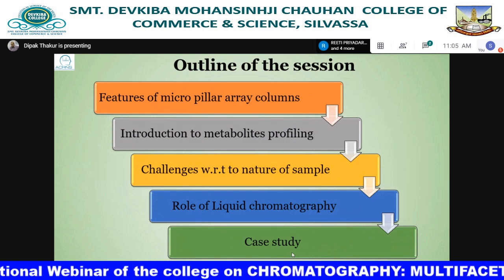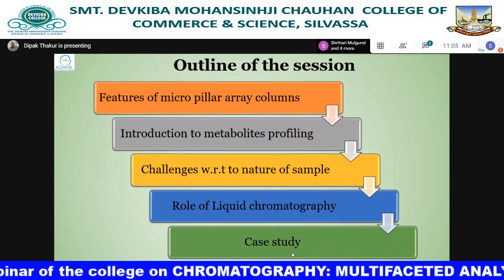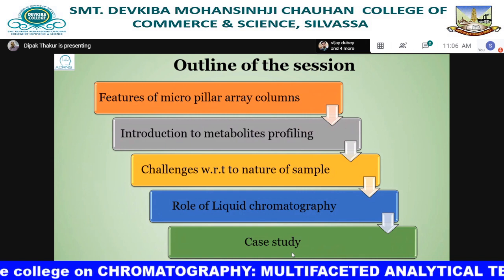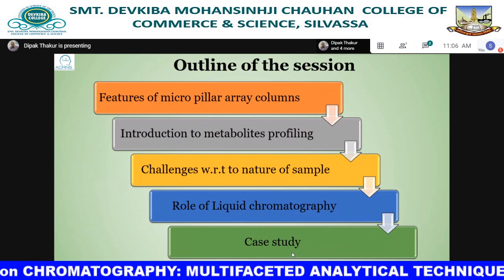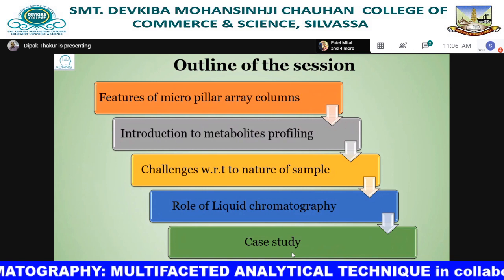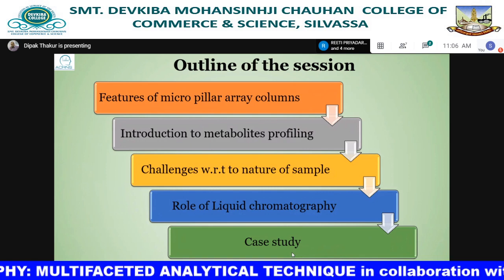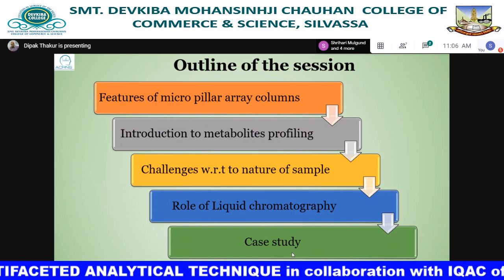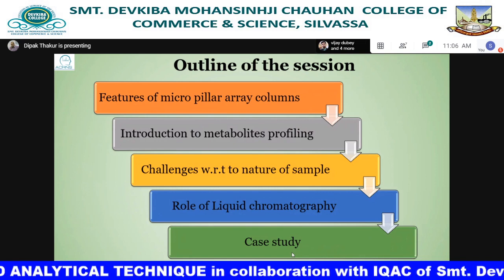The outline of today's session is, again, I'm going to go over the features of micro pillar array columns, and this is going to help those who are joining today. Then we'll be looking at an introduction to metabolites profiling. What is the role of metabolites profiling? How is that useful? That's what we are going to see. Then we are going to see the challenges with respect to nature of sample and the role of liquid chromatography.